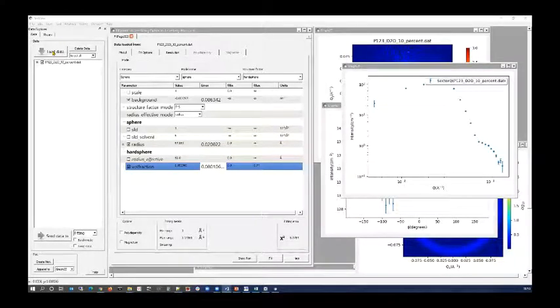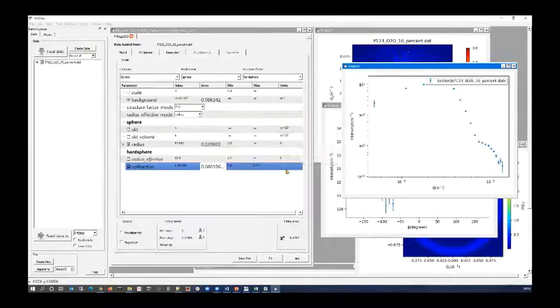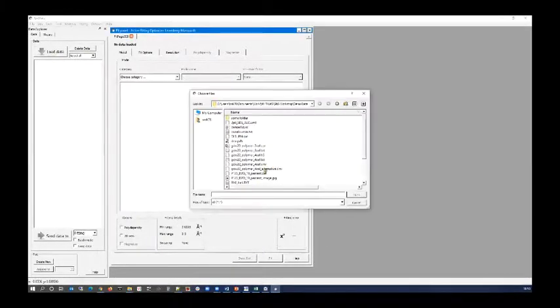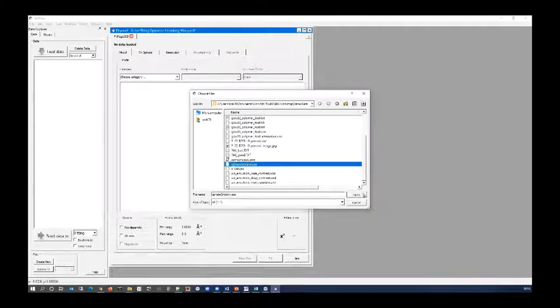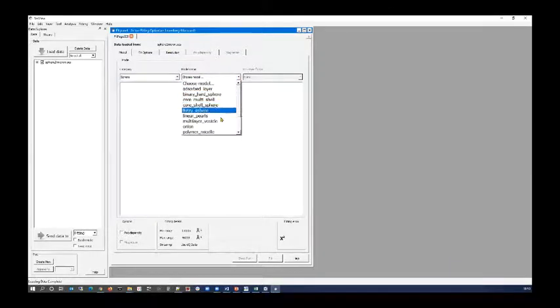So what I'm going to do is I'm going to load in a, let's clear everything first, sorry. I'm going to load in a SESANS dataset. And we've set SasView up so that if it finds a file with the extension .ses, just something we invented, it's going to assume it's SESANS. I can then send that data to fitting. Now, the name of this file is actually giving things away. It says it's 2 micron spheres. So I guess we're going to need a spherical model again.